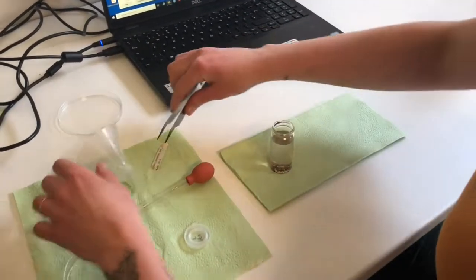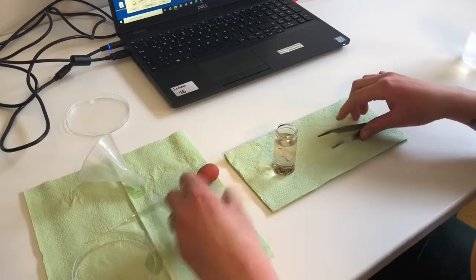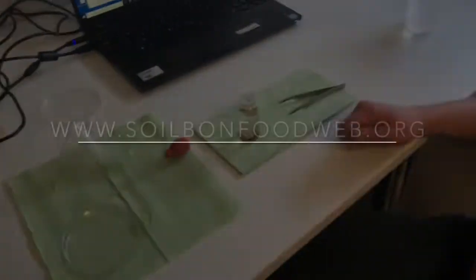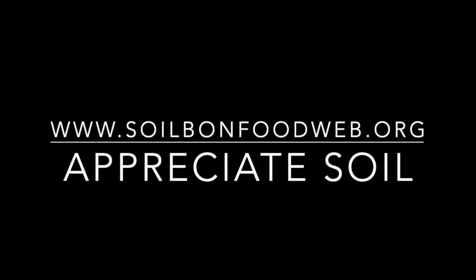Do not forget to put the label inside and name the image using the sample code. If you have any questions, contact us.